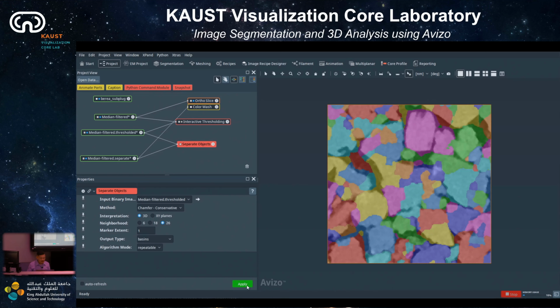Finally, the last option is the mask of this basin as a binary image, called connected objects. This is the last option, and I like it the most. This last option is actually the same as the first option, split only, you get the same result.